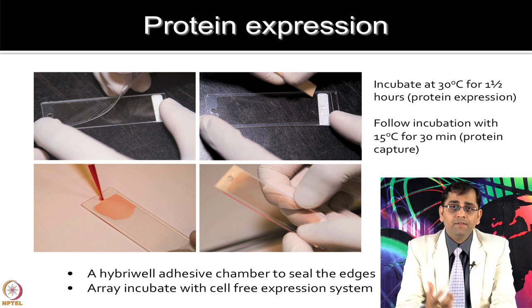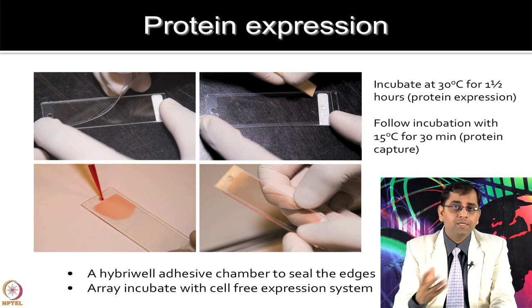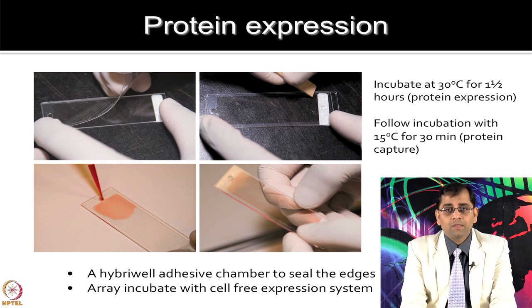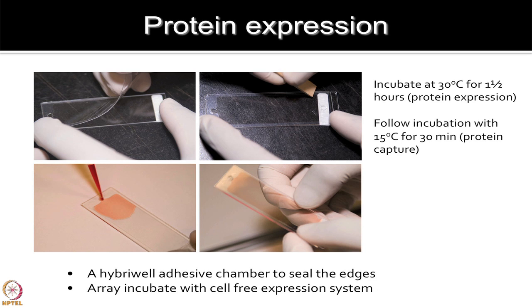Once you are ready with this part, you can do incubation at 30 degrees for 1.5 hours, and then lower the temperature for the capture step to 15 degrees for 30 minutes. Now, starting from the DNA on that day, you have the proteins made on the same chip.